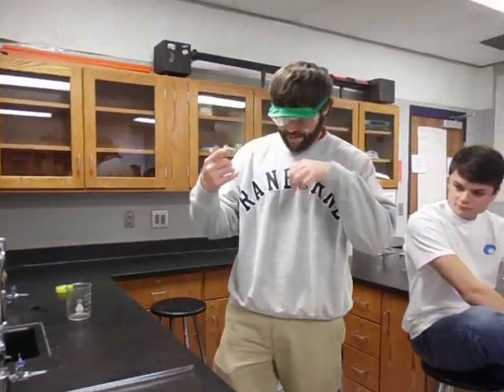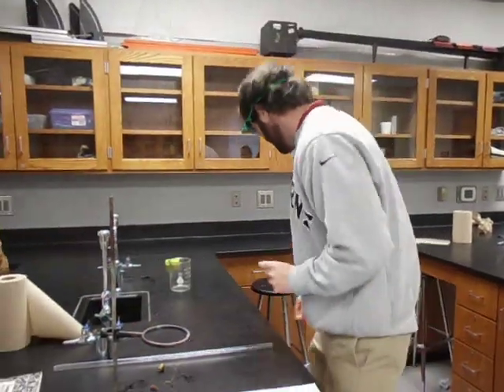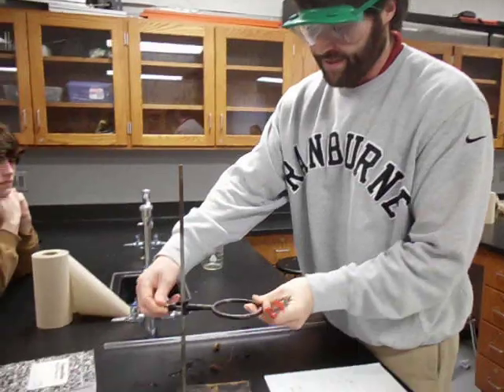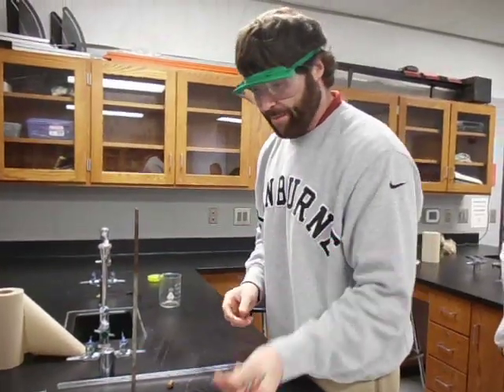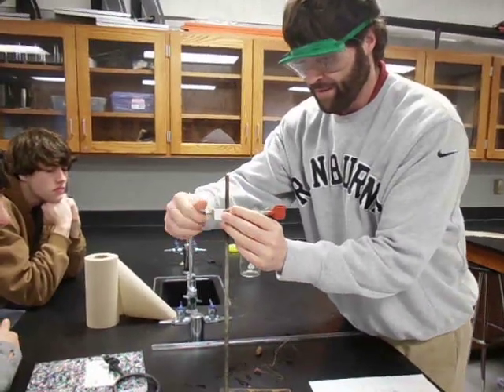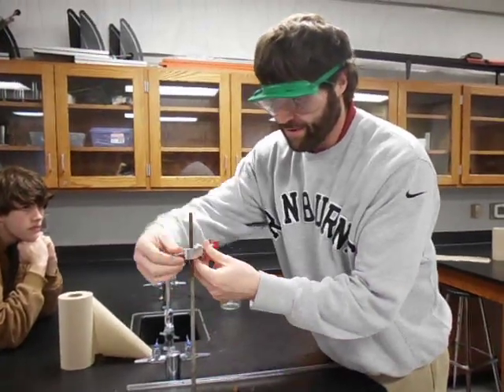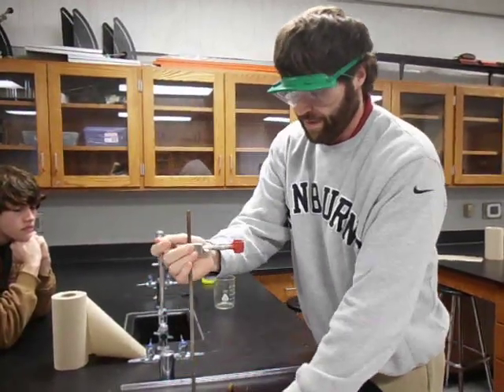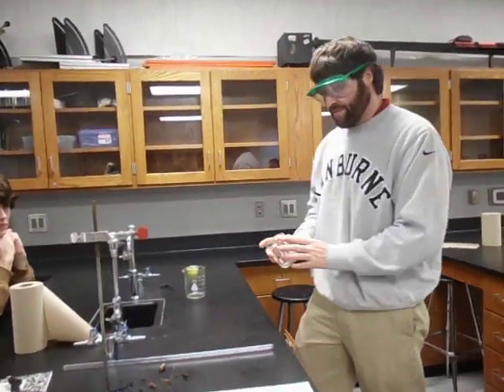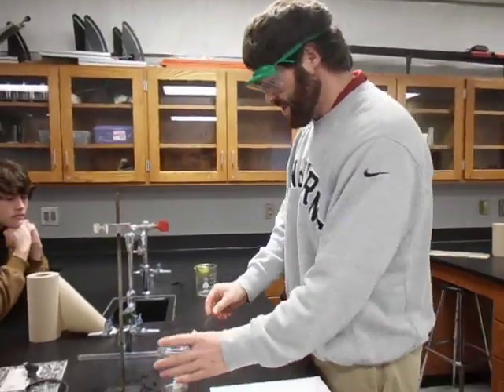Other things you'll need to go get: a ring stand, a burette clamp, and a 250 milliliter beaker. I'm going to put the burette clamp up here and twist it so I've got some room off to the side. Then I'm going to set the 250 milliliter beaker underneath that.